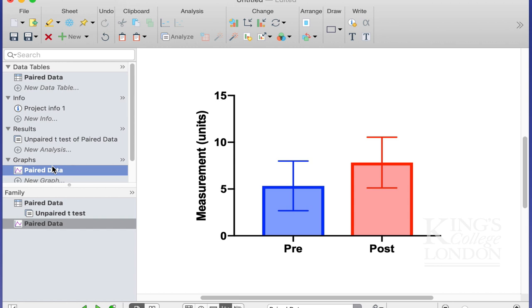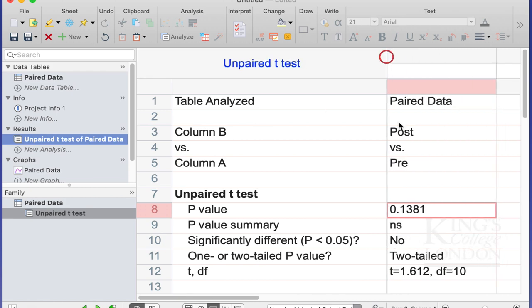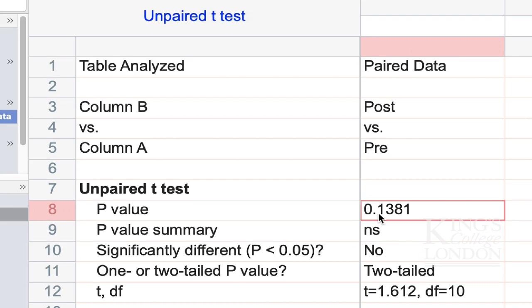if we were to carry out a standard student unpaired t-test between these data sets, which I've done here, you'll see that our p-value is 0.138. Therefore, it is not significant.